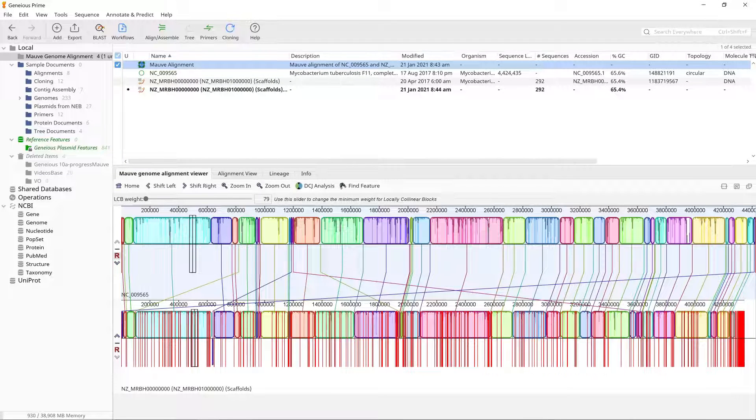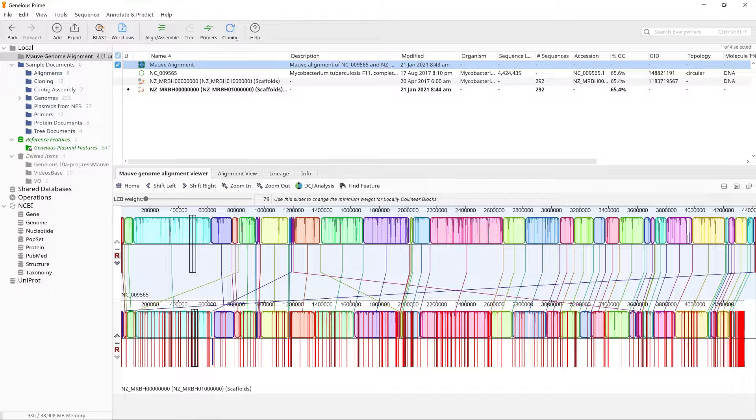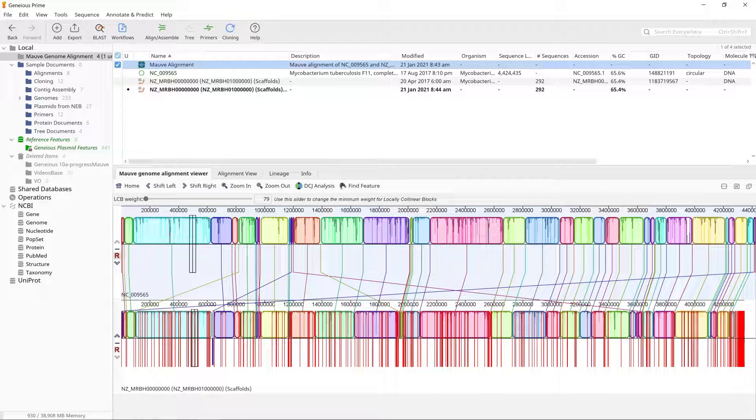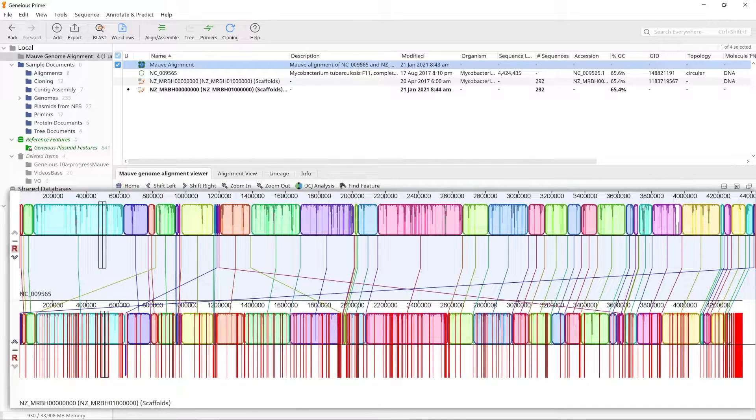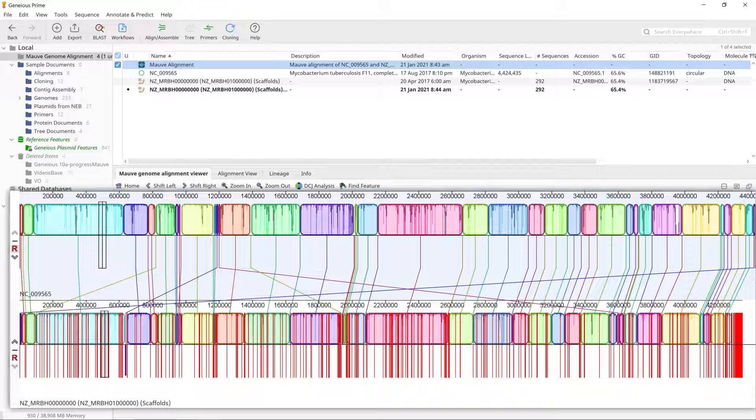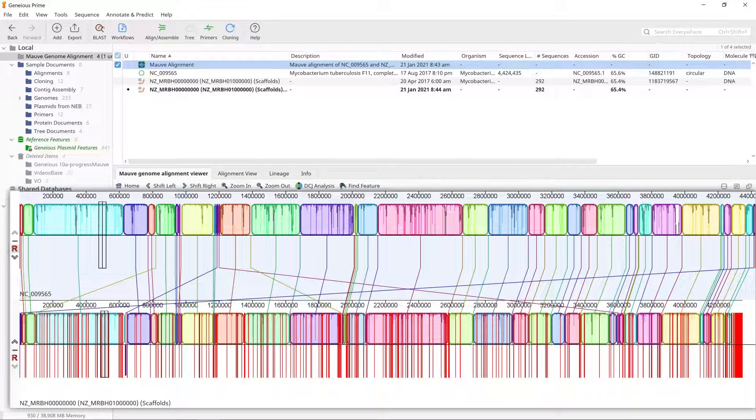Open the MOV alignment document. If you have already watched video one, you will notice that this alignment has more locally collinear blocks or LCBs than the whole genome alignment in the previous video.